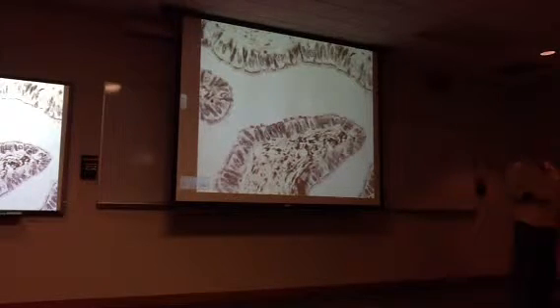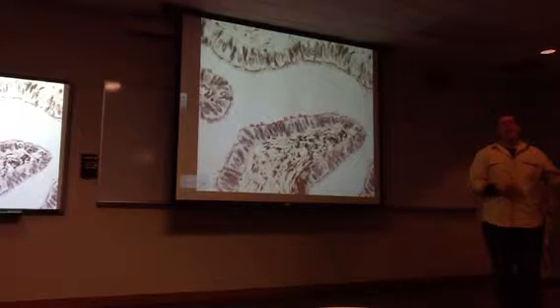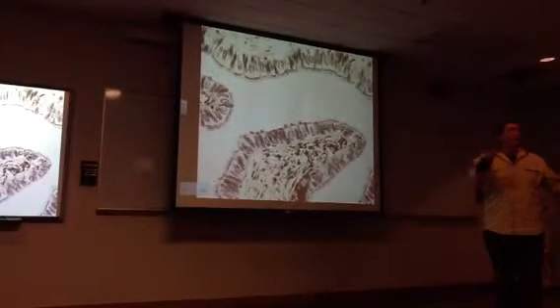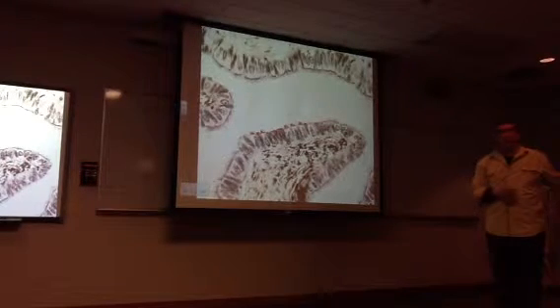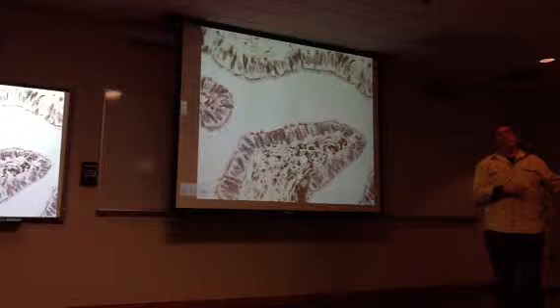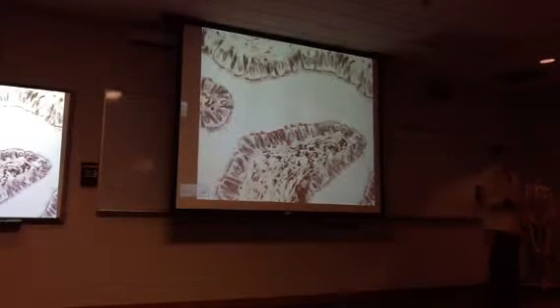Okay, the non-ciliated cells are sometimes called peg cells, and the appearance or lack of appearance of cilia depends on where the person is in the monthly cycle. So the appearance of cilia is very much dependent on the hormones that are acting on the tissue.